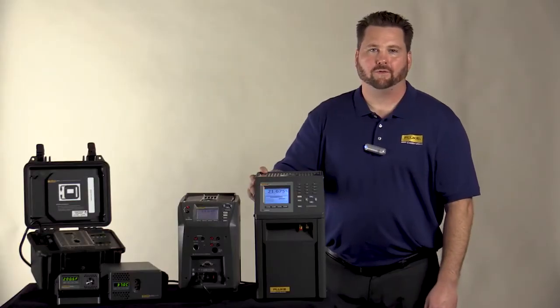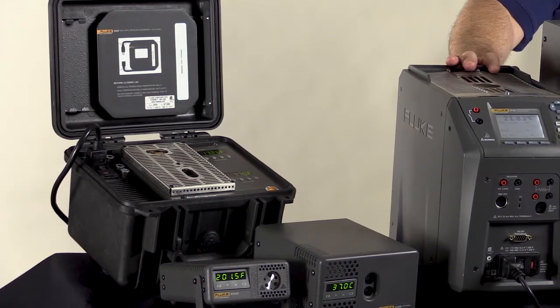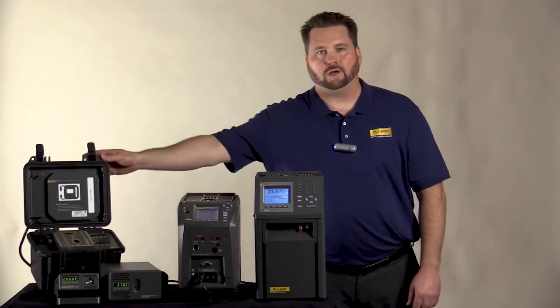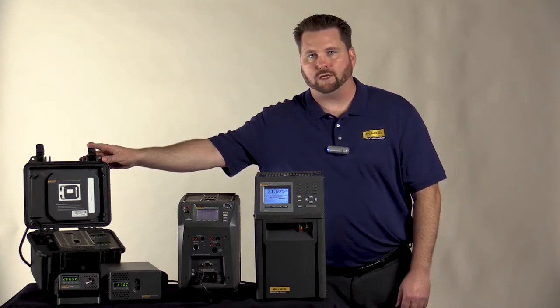Let's take a closer look at a few of our drywells. The 9100S and 9102S are small and portable and provide you with a range of minus 10 to 375 degrees C. The next unit here is our 9009, which is a dual-well calibrator, allowing you to run both hot and cold temperatures simultaneously. This unit will allow you to run minus 15 up to 350 degrees C on the hot side.